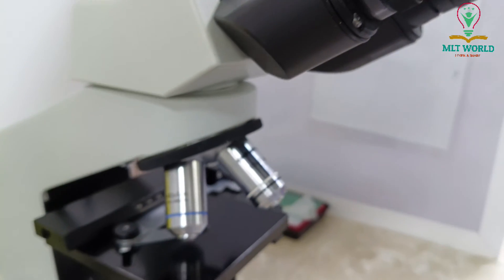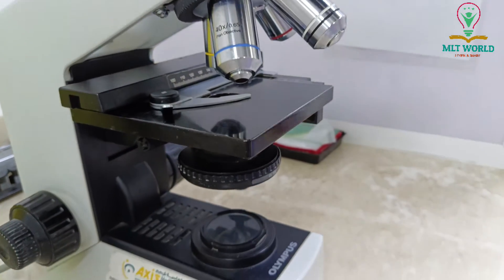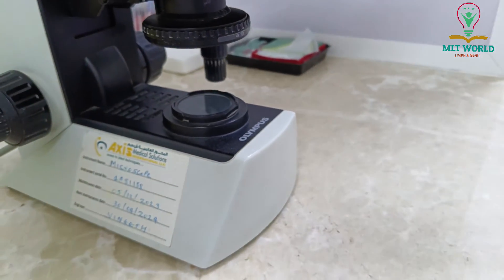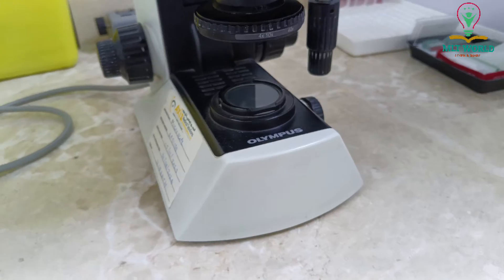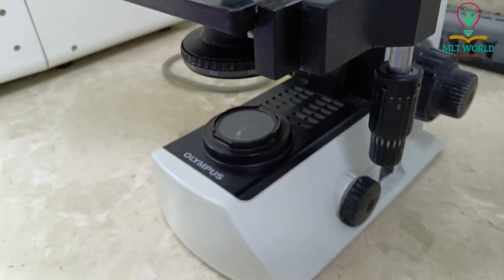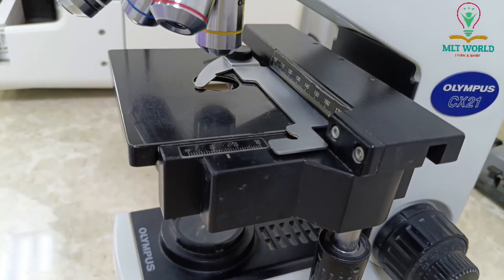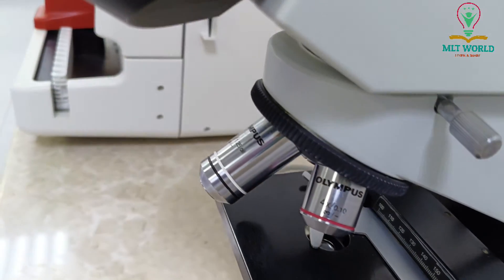Welcome back to MLT World. Today I will show you the microscope that we use in our routine microscopy in the laboratory. This microscope is from the Olympus brand and the name of this microscope is the CX21 Olympus.